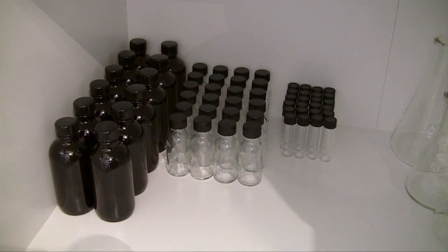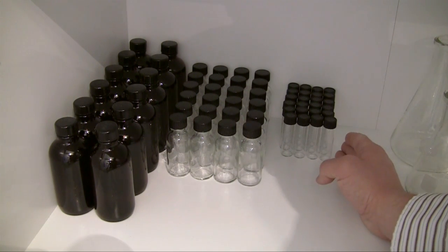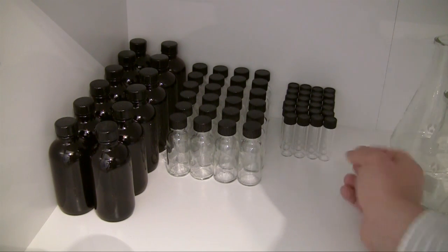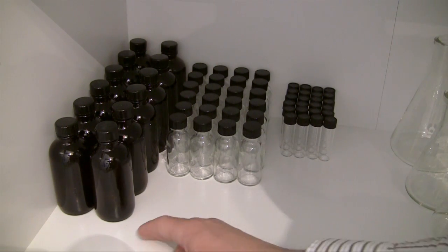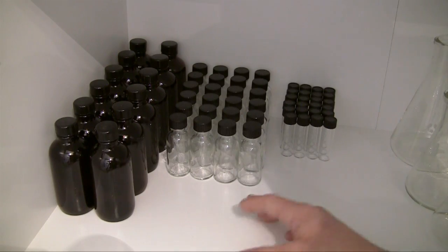So that's what these are right here and another cool thing is they're actually really cheap. You usually get them by the dozen or a twenty pack. For example I think these ones came in a twenty pack and I think this entire thing was under ten dollars. So it's nice to have a mixture of plastic and glass and also a variety of different sizes.